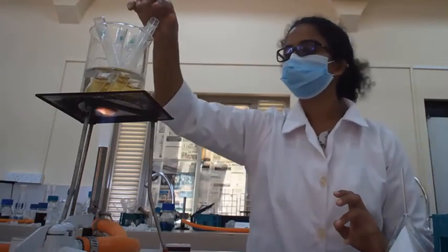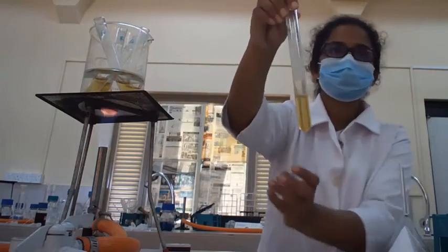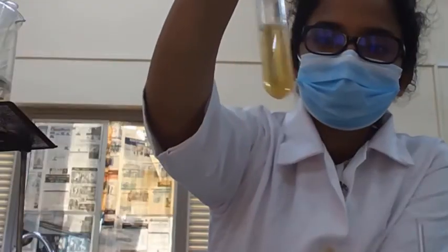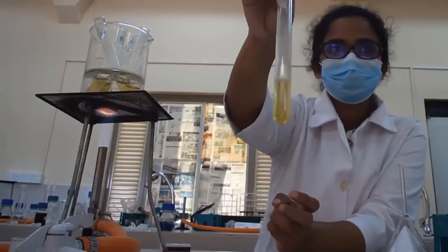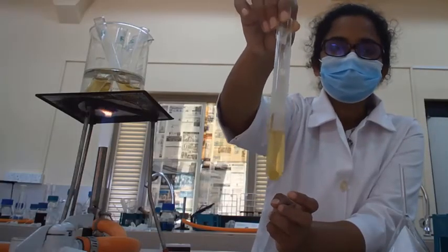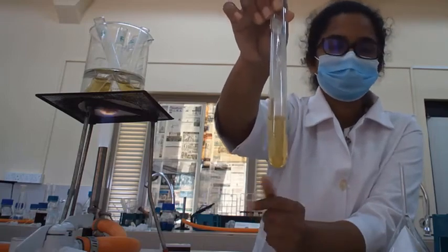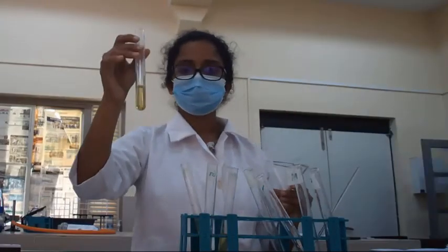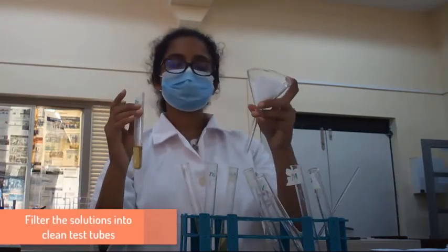Then after the solution gets properly dissolved, when we see a clear solution, we are going to take it out of the water bath and filter these sugar solutions. After that, we are going to filter these solutions into another test tube.